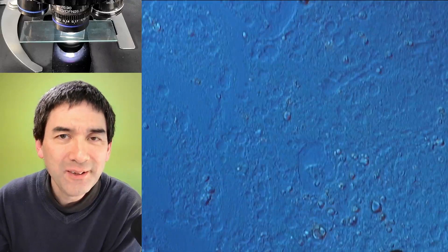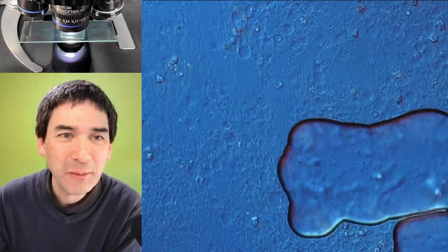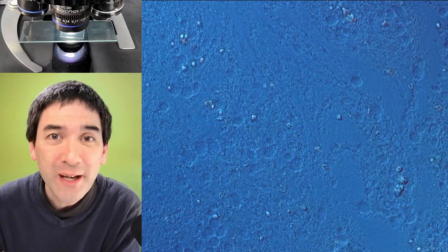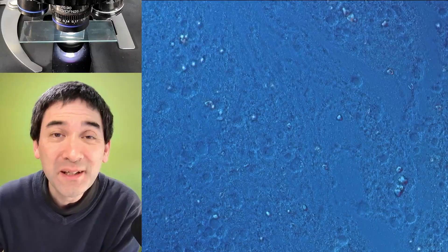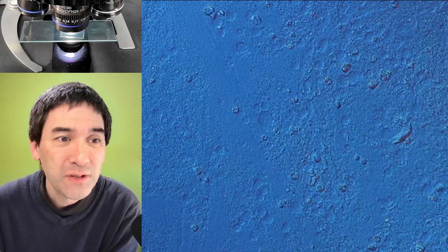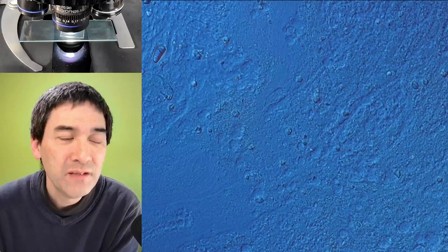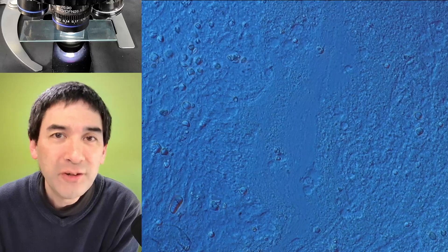What we see is a totally undefined mass of goo. These are some air bubbles here. We're not able to see individual cells — which is a little bit as expected. The reason is because a slime mold is like a gigantic single cell. The individual cells are not separate anymore; they've fused together into a gigantic mass containing hundreds if not thousands of nuclei and other cell organelles, but no separate cells. You can even see some cytoplasm flowing here, but there are no individual cells visible.